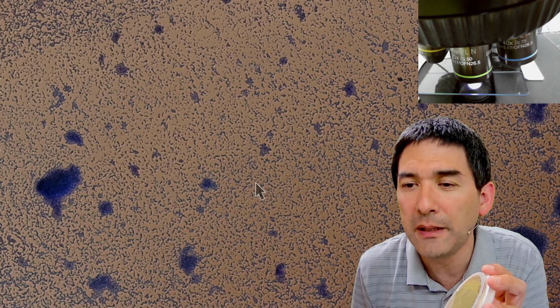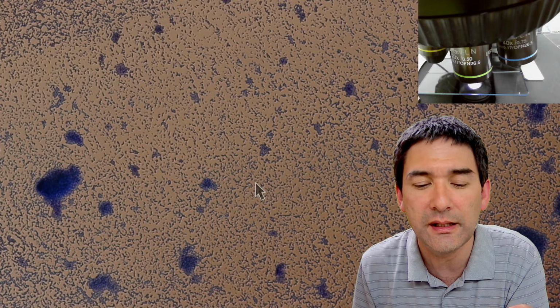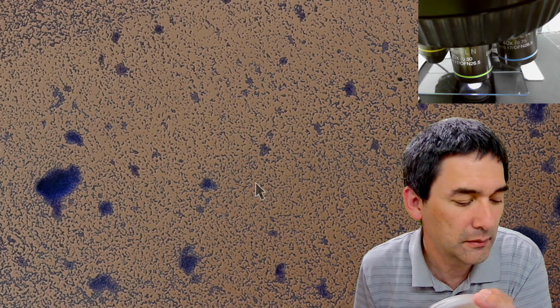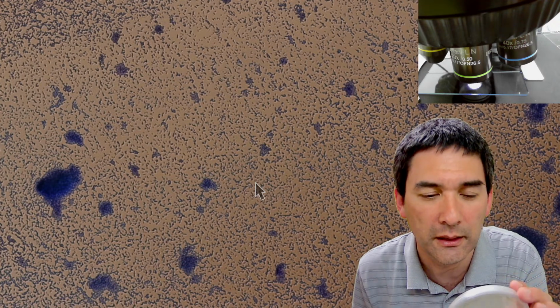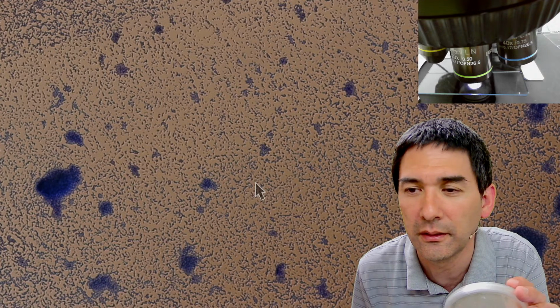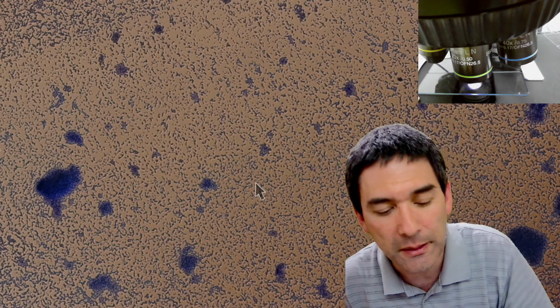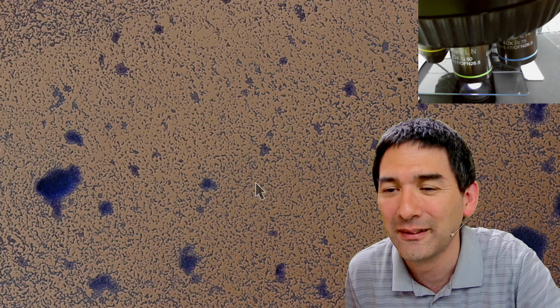Are you using LB broth? No, this is not LB broth. I think it is the medium according to Kimmel, if I remember correctly. I was not able to find LB broth ready-made, unfortunately.